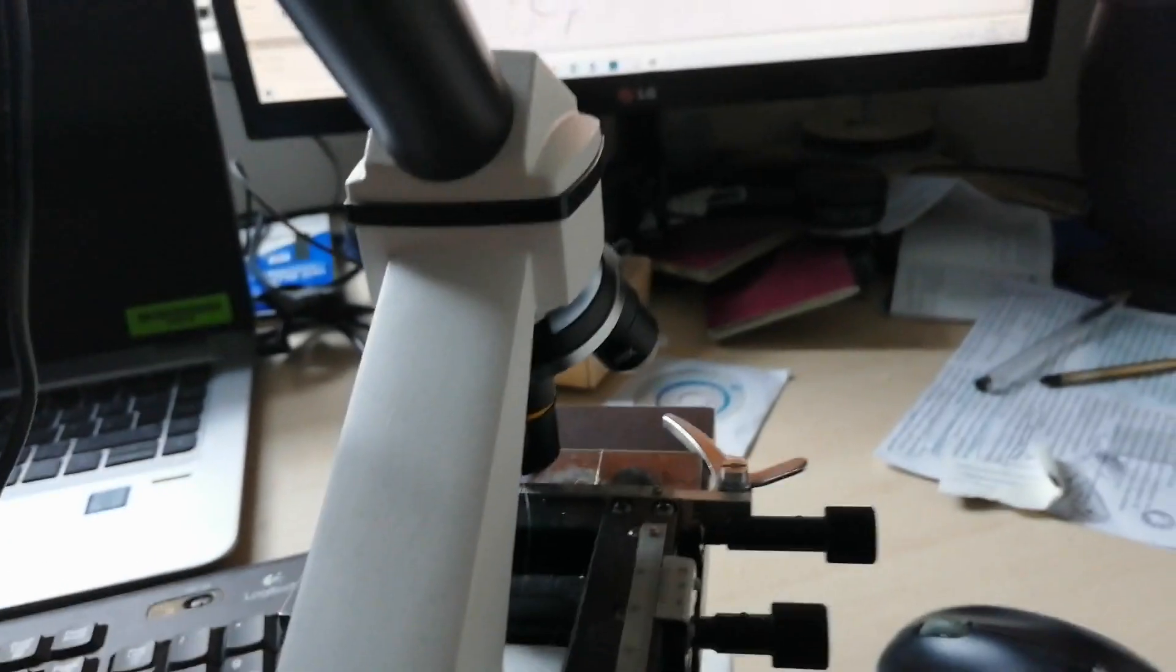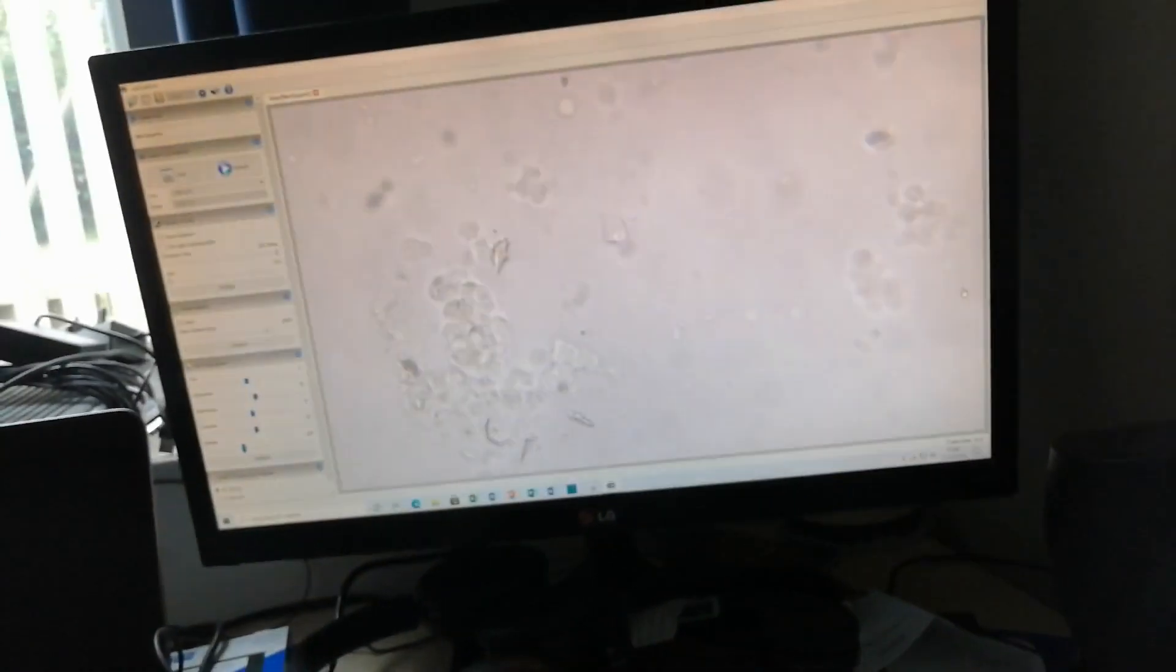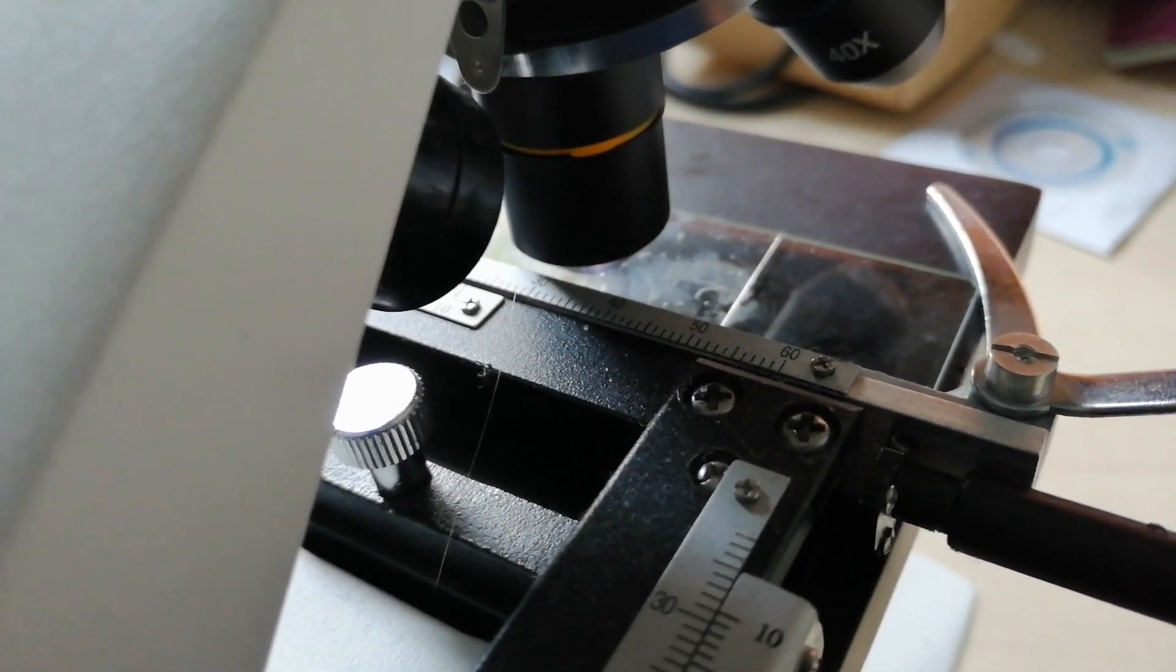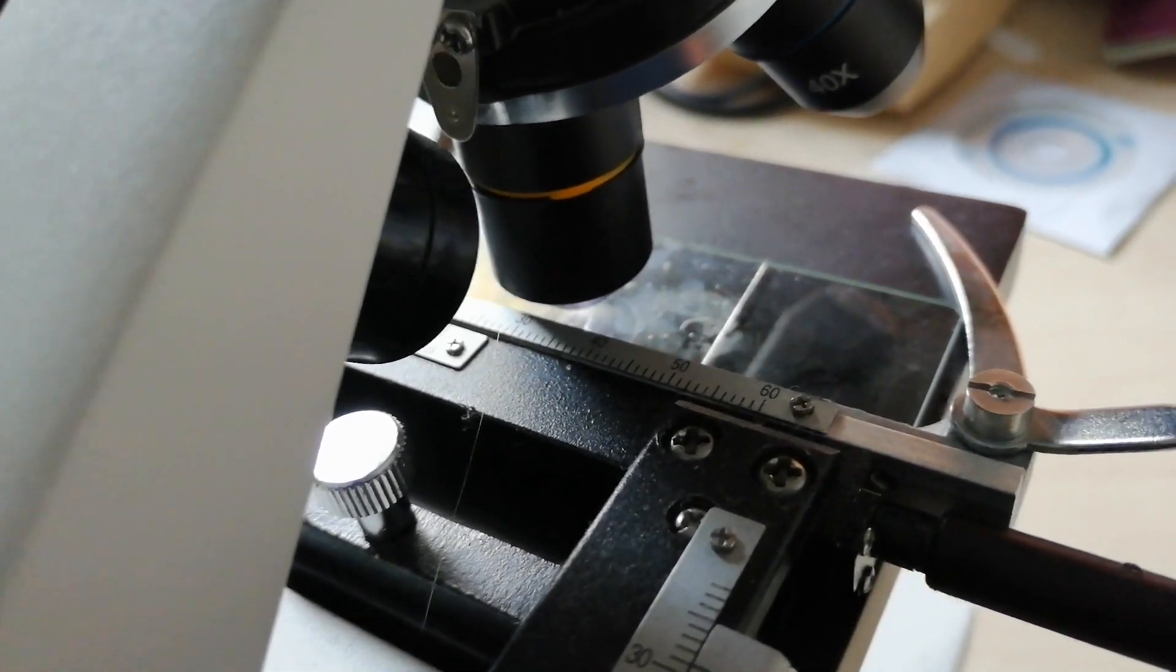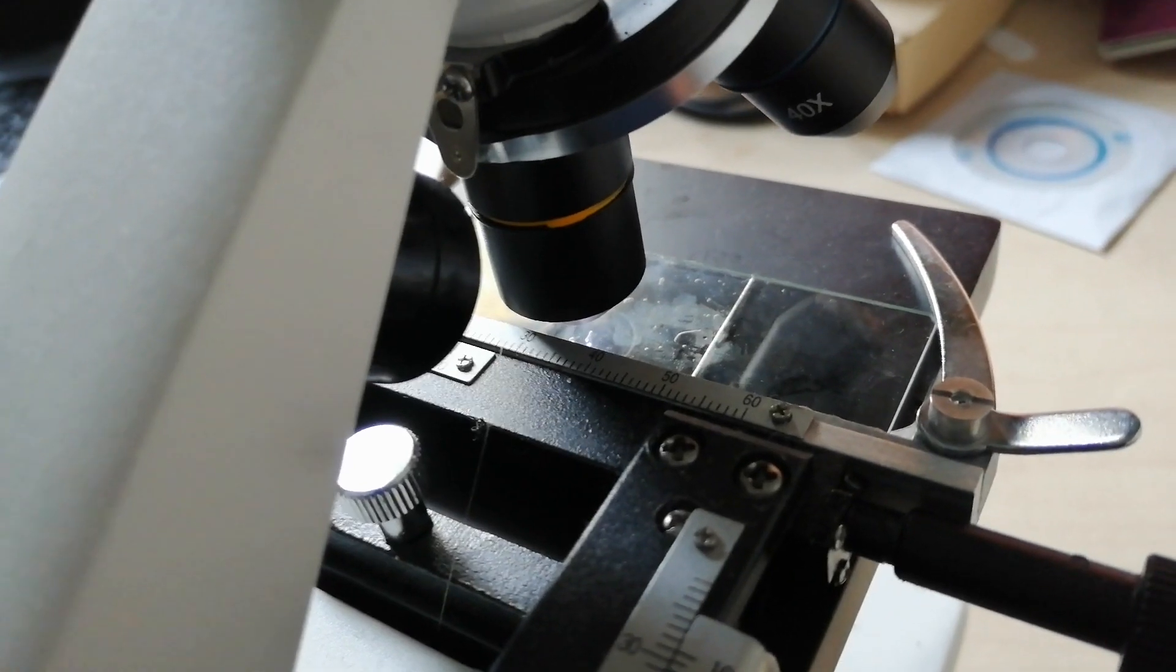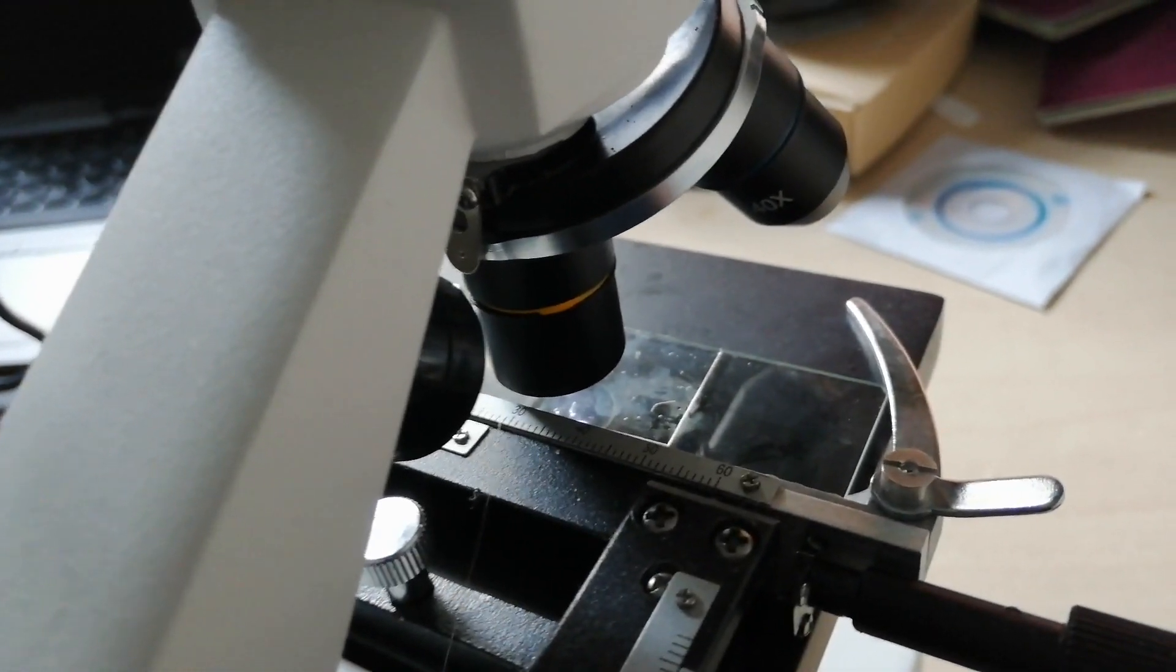Okay, if I find anything I'll start it up again. Yeah so nothing, edge of the glass, up and back the whole length. So nothing found on the first script, so good. Try the second slide now. So nothing on either slide. You never really want to find anything, but equally if you do find something you can treat it. Okay let me try another fish or two, hopefully on the clean bill of health before the recovery is going.